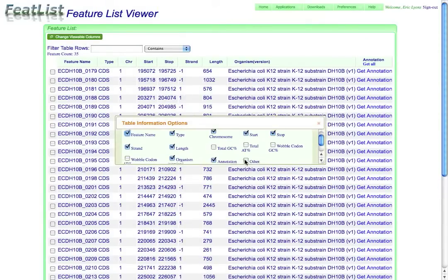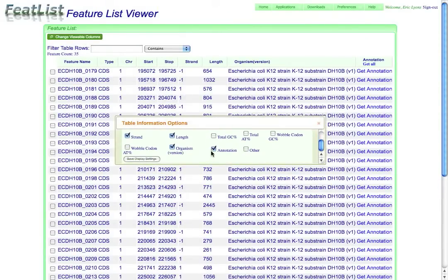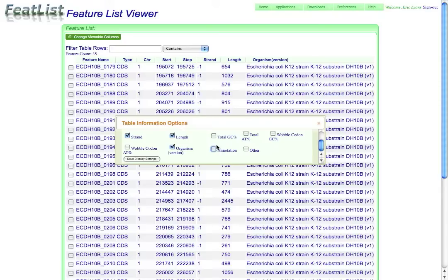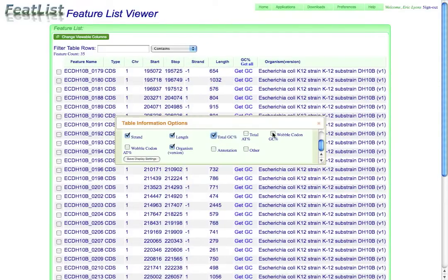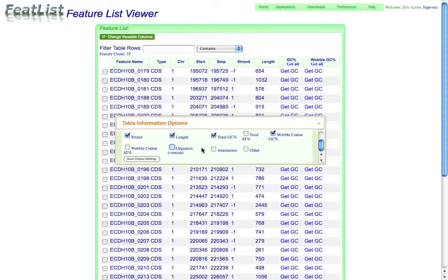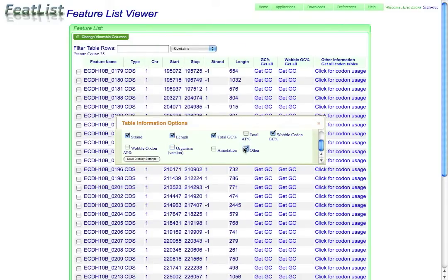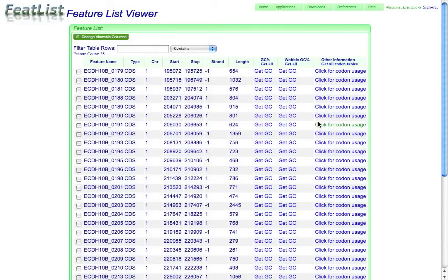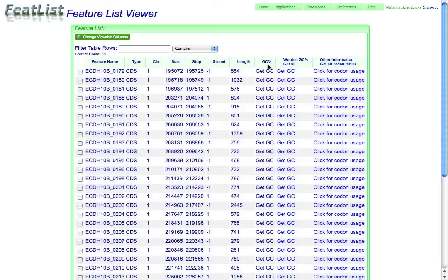I'm not interested in looking at the annotations, but I am interested in the total GC content, the GC content of the wobble position of the codon, as well as something else, which is the codon usage of these proteins.